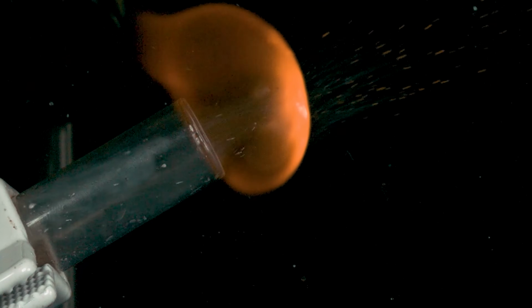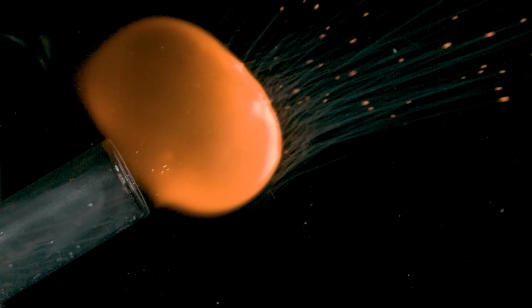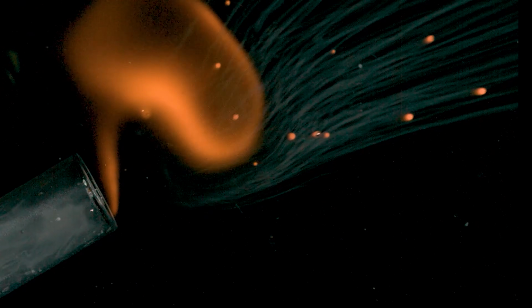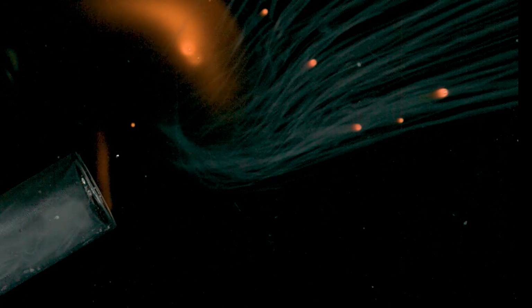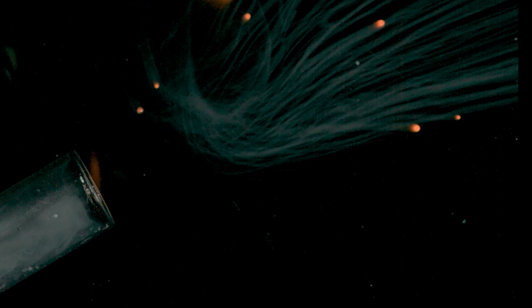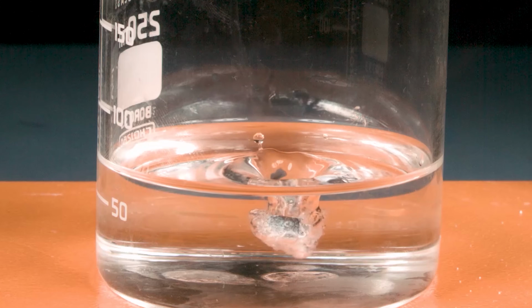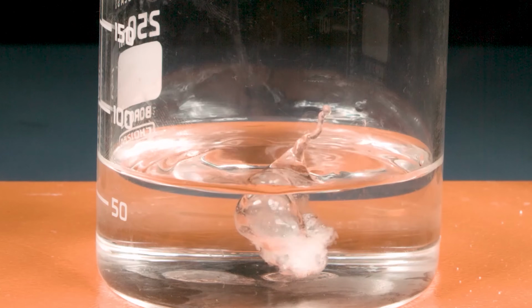You can see that for sodium, the explosion is bright orange, almost yellow, and all of the shrapnel is also glowing in that same orangish glow. That's because the atomic transitions in sodium are just brighter and orange. Here's potassium dropped straight into a beaker. Something cool happened that I did not notice until editing the video.